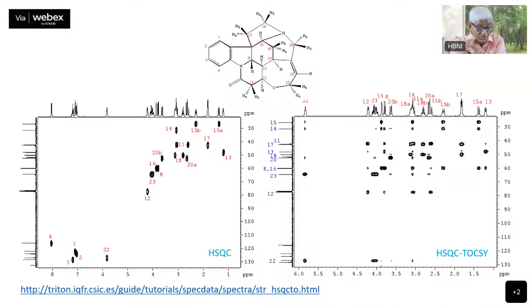Again, all the assignments are given. This is a very large number of protons. All the way from 1.0 ppm to 6 ppm, there are 22 protons. There is also 23 there. The 23, that's carbon probably. The labeling is of carbons. Okay, and then you have the protons. So 23 carbons, and the corresponding protons are indicated by the carbon numbers.